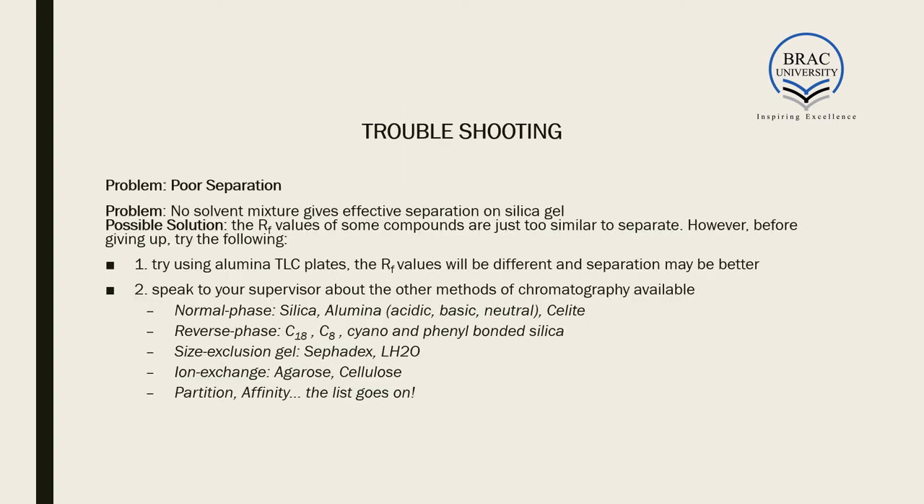Finally, troubleshooting: when carrying out column chromatography you may run into problems. For example, if no solvent mixture gives effective separation on silica gel, the issue may be that the Rf values of some compounds are very similar, making them very difficult to distinguish and separate from one another. Before giving up, you can try using alumina TLC plates.